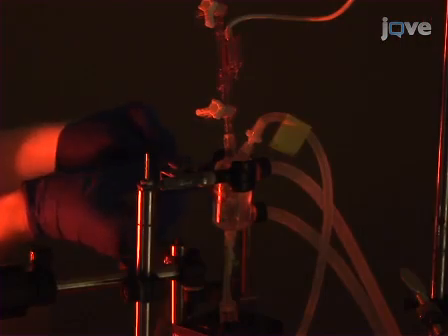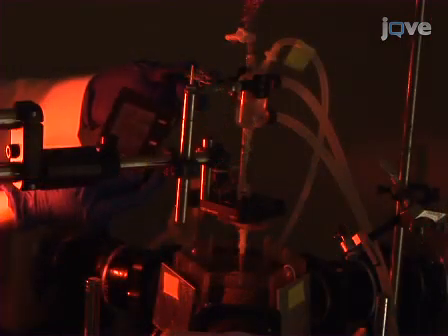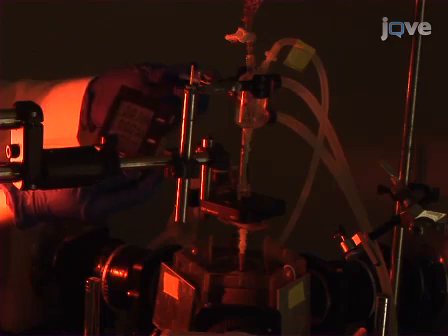Then take a picture of each focused image on the frosted glass. Slowly inject 10 to 20 microliters of di-4-ANEPS stock solution into the perfusion solution through the injection port in the air bubble trap and wait 3 minutes.